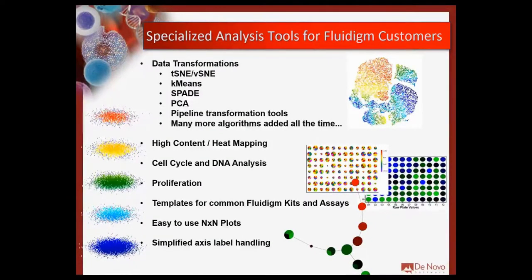You can see that we have quite a few transformations already available, and other ones are going to be launched within the next couple of months. Again, we're going to be building, and I'll be showing an example of, pre-built templates for common Fluidigm kits and assays.